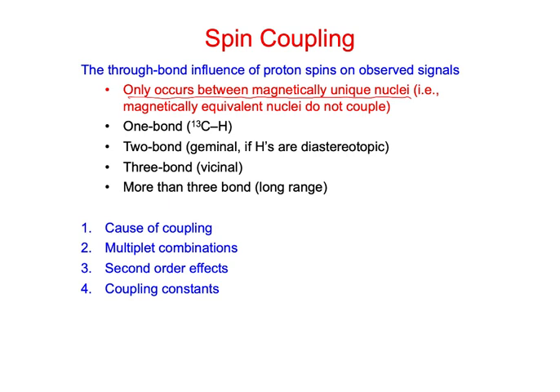We're going to look at a number of different situations. This first one we're going to save mostly for when we go to talking about C13 NMR, but we can have one-bond couplings. So this would usually be a situation where we'd have a proton splitting a C13, right? And the carbon being split by the protons that are directly attached. We don't really have any proton-proton coupling that's a similar situation.